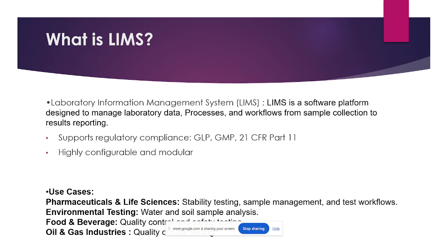We had practicals, and whatever data came from each practical, we generated on paper. But now the application has been developed, so all the data, including the procedure data and results, we can manage in the LIMS application only.